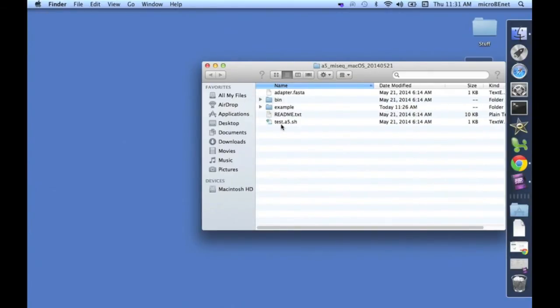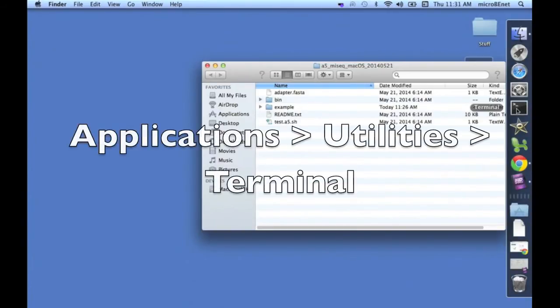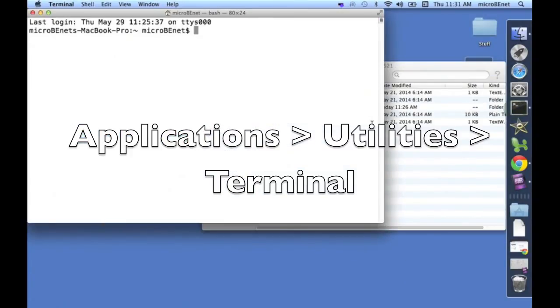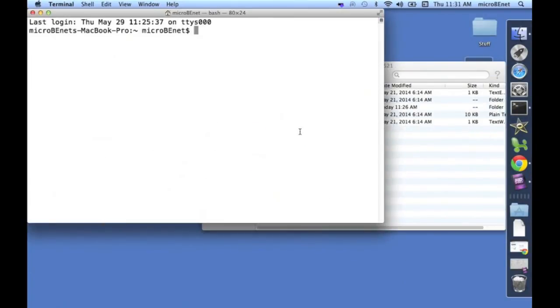To run A5, we need to be in the command line, so let's open up the terminal. Here it's in my dock, otherwise you can find it in your Utilities folder under Applications.